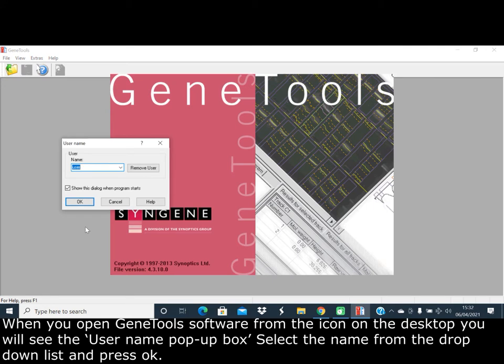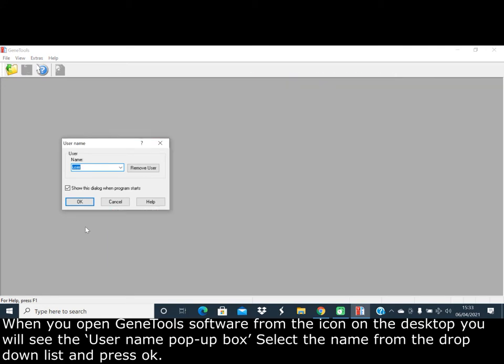When you open GeneTools software from the desktop icon, you will see the username pop-up box. Select the name from the drop-down list and press OK.